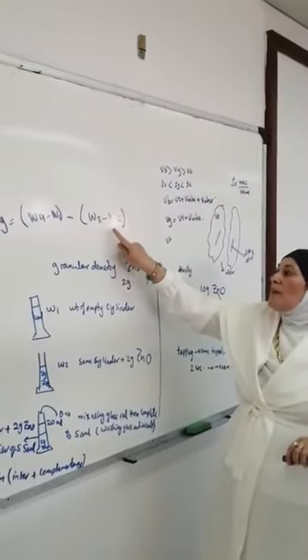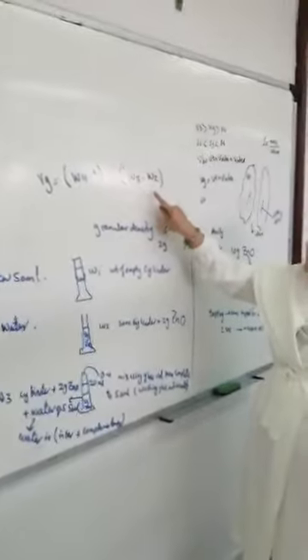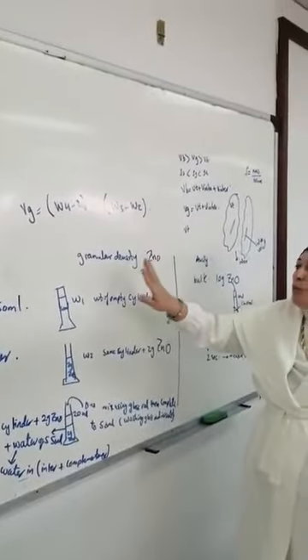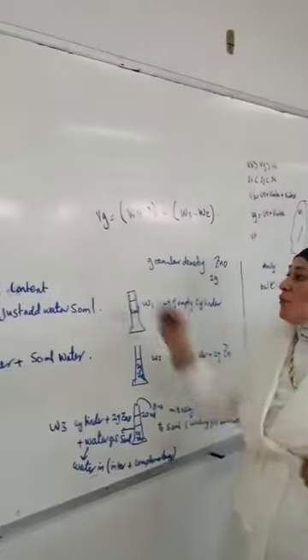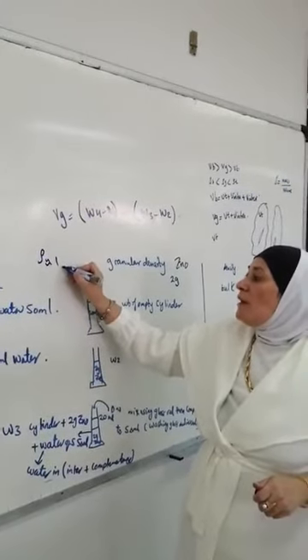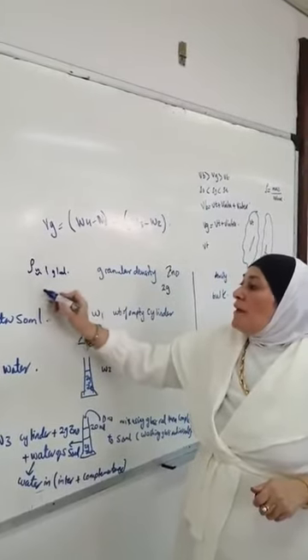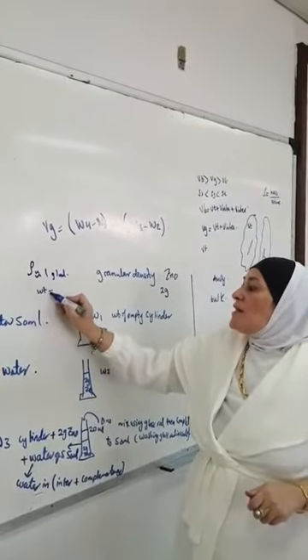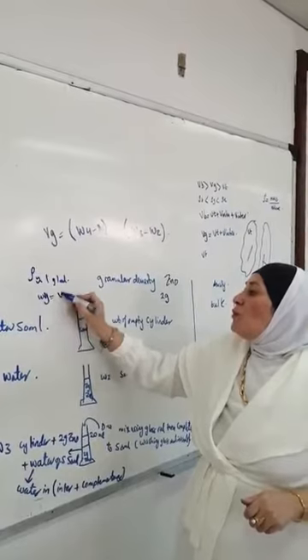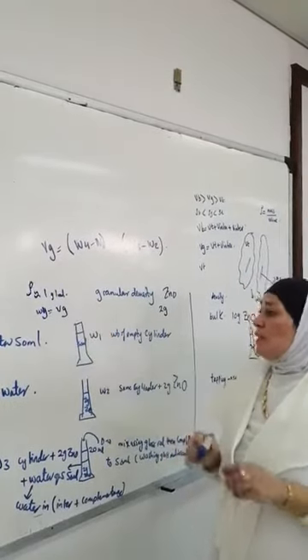We will get the volume of the water where the powder is in. Because really the density of water is almost 1 gram per ml, so the weight is the same. WG is equal to VG.